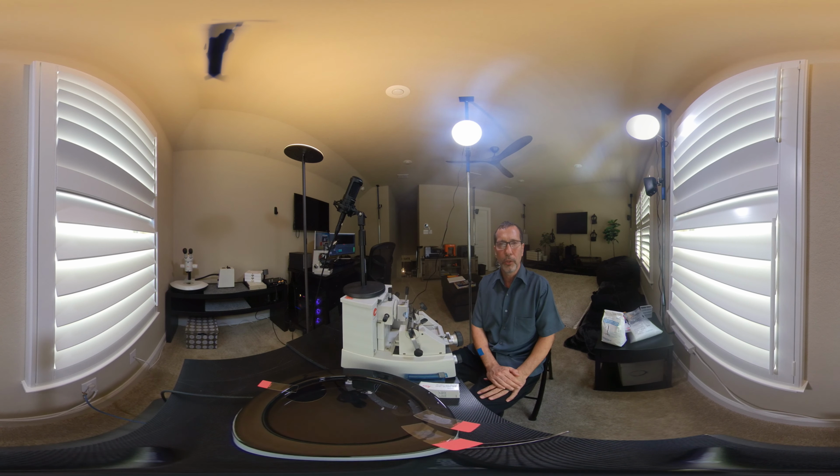So why would you want to use one or the other, I guess would be the question. And I would answer that by saying that there are pros and cons to each of them, and everything in between, of course. But a hard paraffin, let's say the one that's about 60 degrees Celsius, works well with sections of tissue that need to be cut very thin, or tissue types that are hard, like bone that has been decalcified.